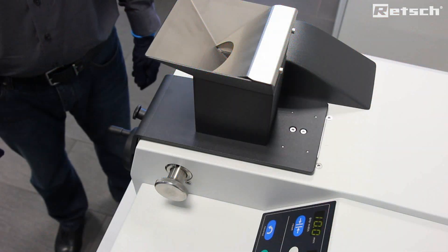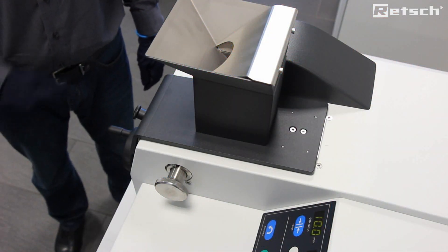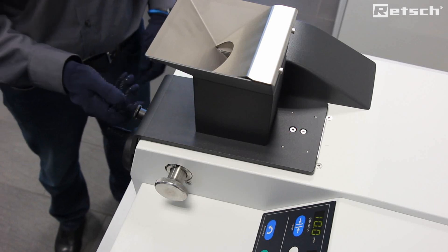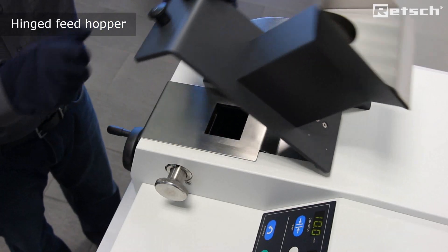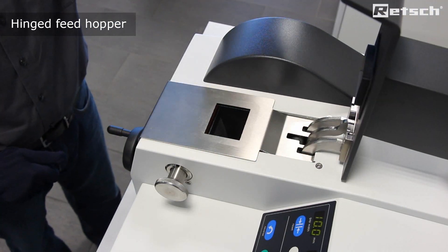Sample material is fed into the BB50 instrument through the feed hopper at the top of the instrument. The feed hopper is hinged for easy access purposes.